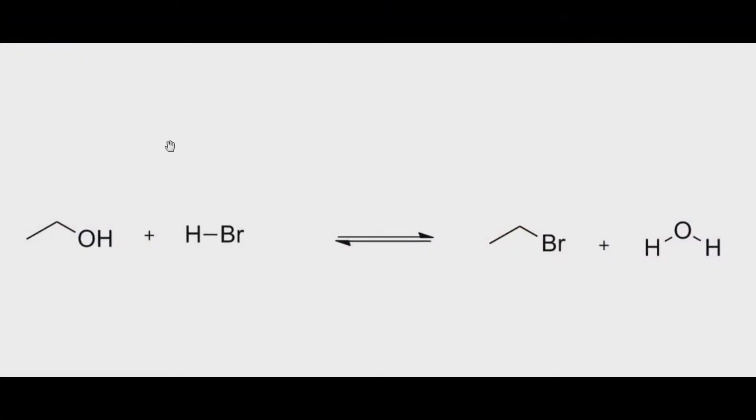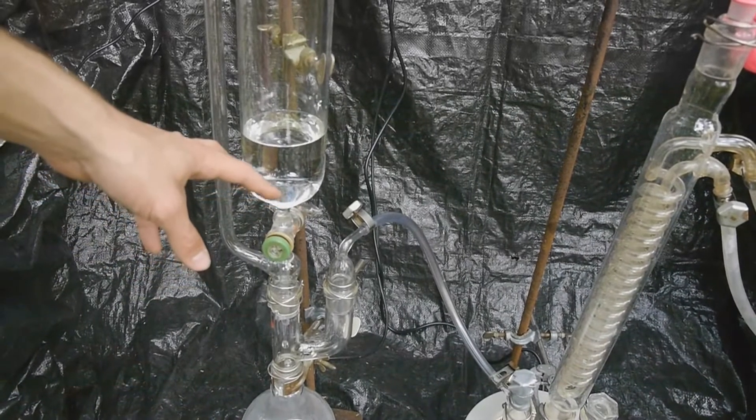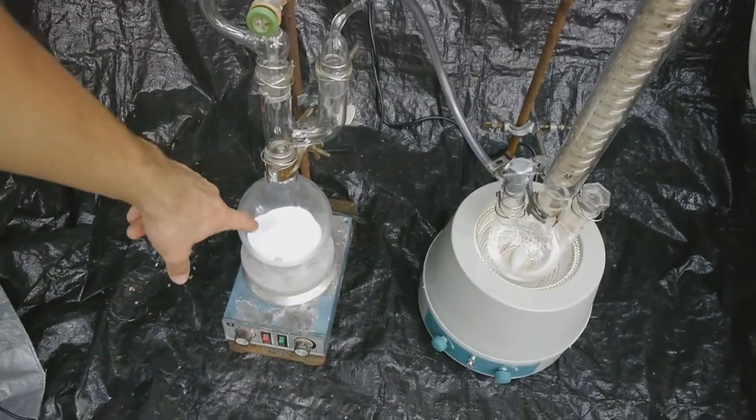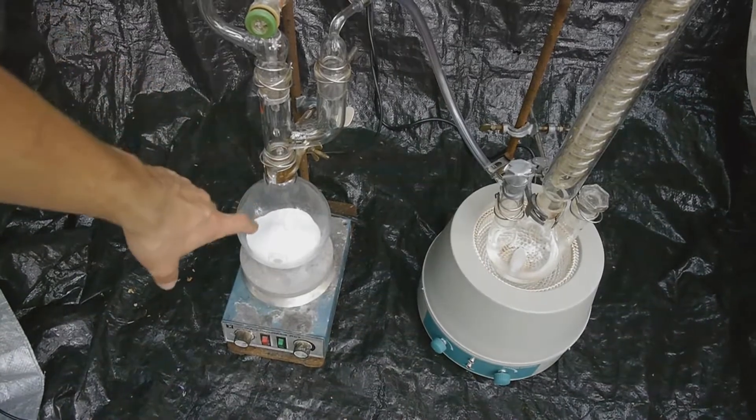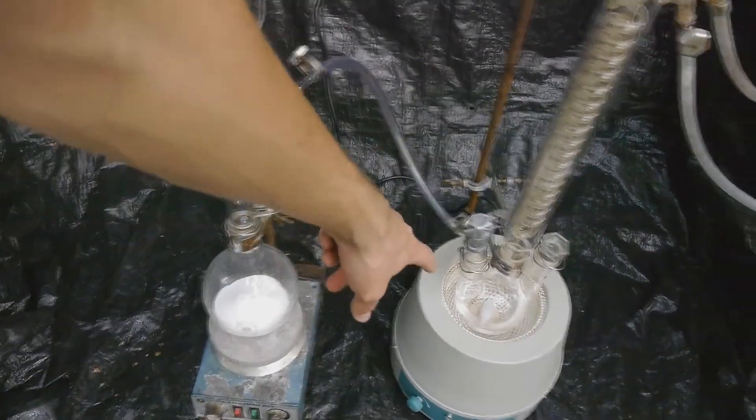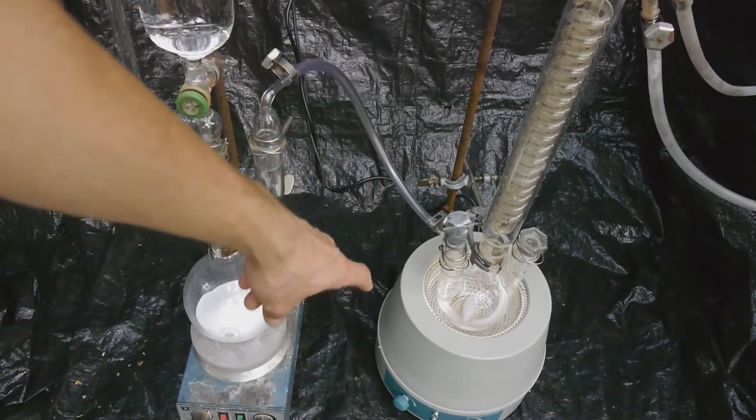In order to make ethyl bromide, we need to react the ethanol with some form of hydrobromic acid. The byproduct forms water in an equilibrium reaction, so I figured it would be best to react the ethanol with anhydrous HBr gas. To make the HBr gas, I just wanted to react some 85% phosphoric acid with sodium bromide, and built this big apparatus to lead the HBr gas into some boiling ethanol.